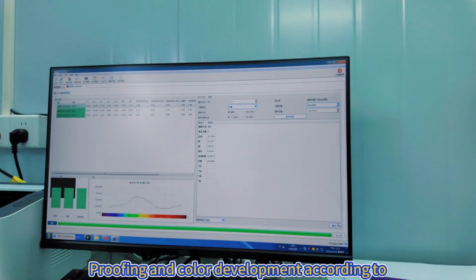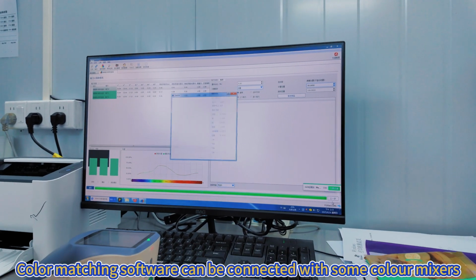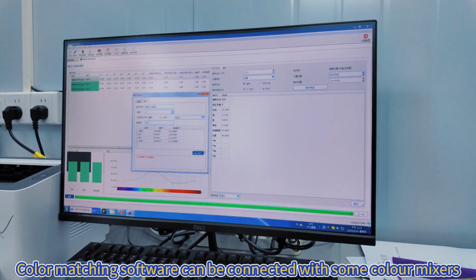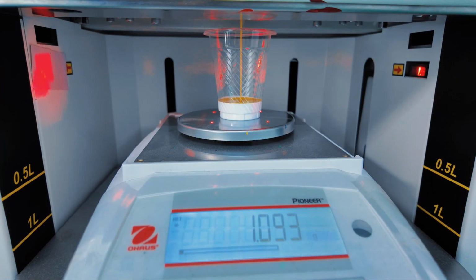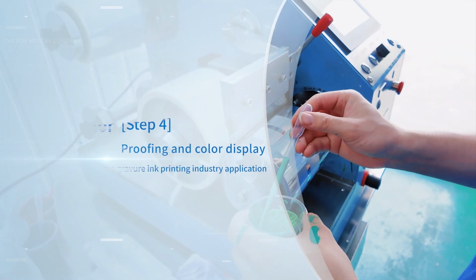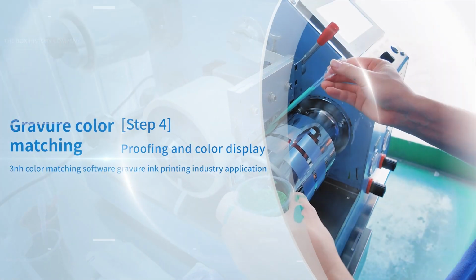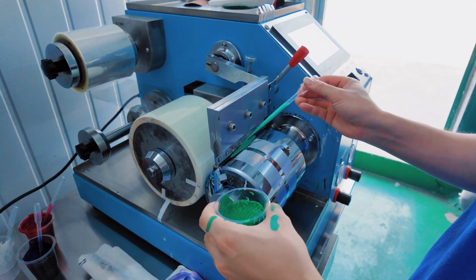Proofing and color development according to the calculated target color formula. Color matching software can be connected with some color mixers, enabling automatic dispensing. After stirring, proofing, and color development.